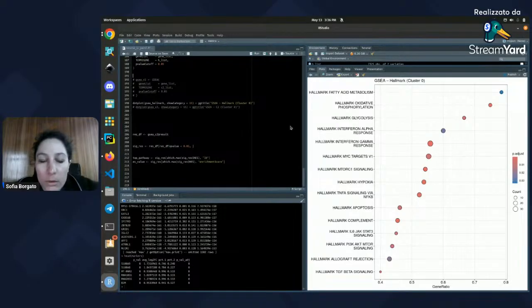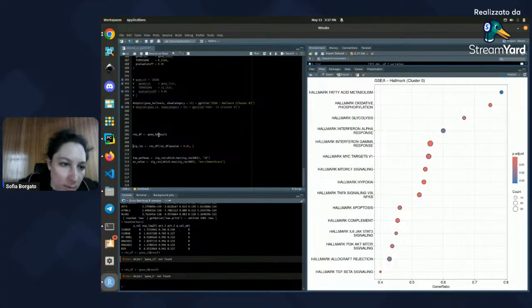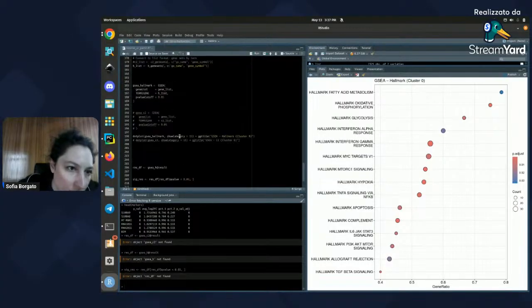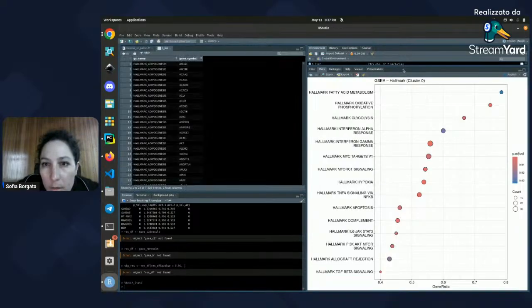Okay, just to show you the results better. Okay, the code is not running correctly. Okay, I'll go there.